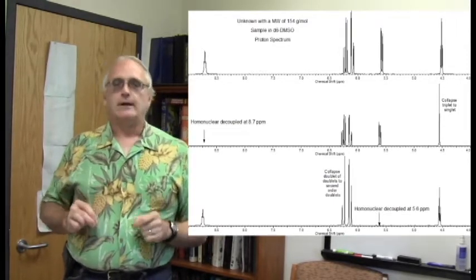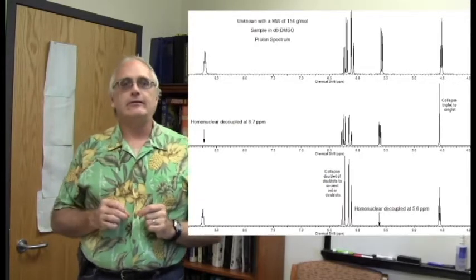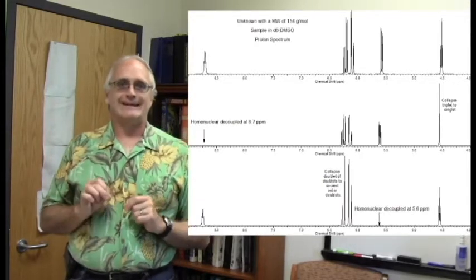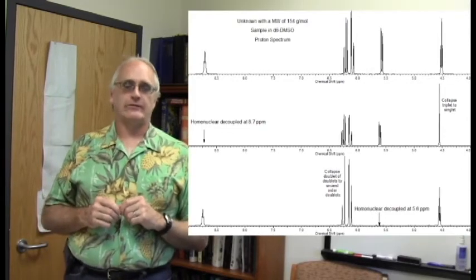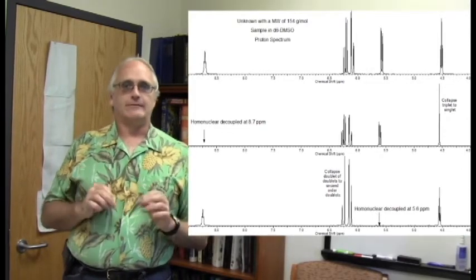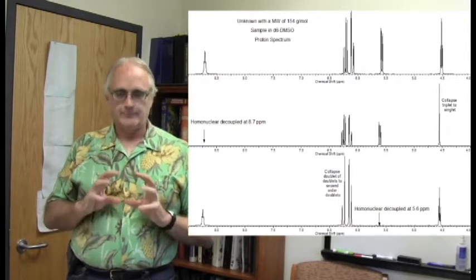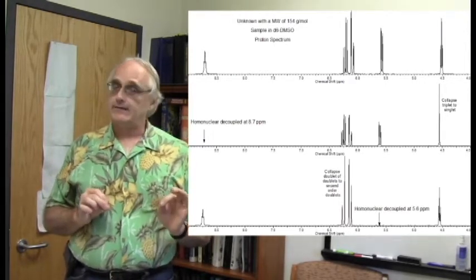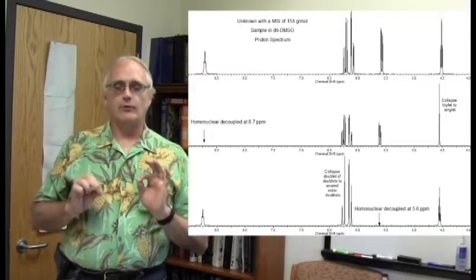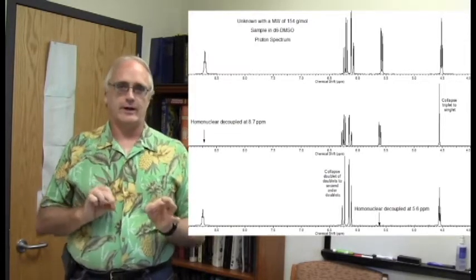And, as you might guess, if you use the decoupler in the alkene region, then the alkene peaks simplify and the doublets of doublets become doublets, just simple doublets. But you'll notice the ratios are very odd. Yes, indeed, there's a bordering first order to second order behavior.